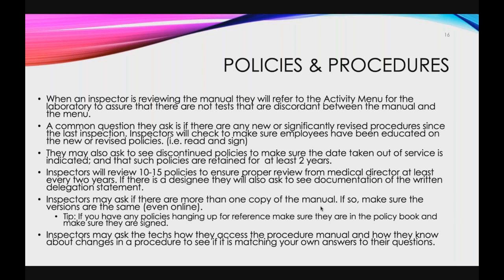The inspectors may ask the techs how they access the procedure manual and how they know about changes in a procedure, to see if what your answer was matches what they are saying. Most of the time, everyone would answer that the same way, but sometimes you may not do a read and sign, or you may just verbally say something. So just make sure that it's all the same.